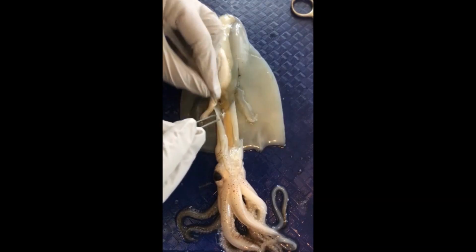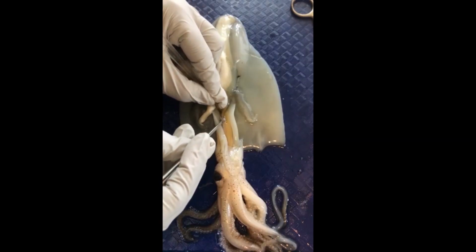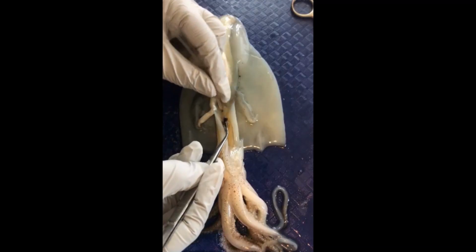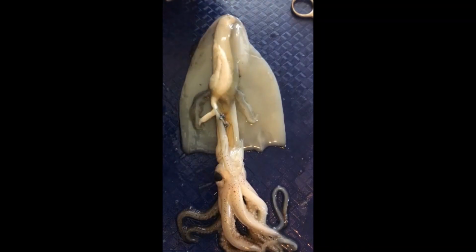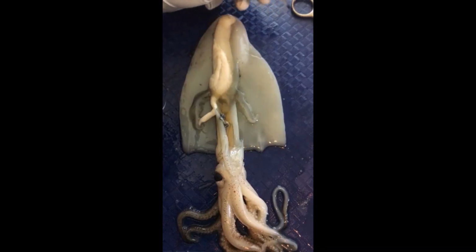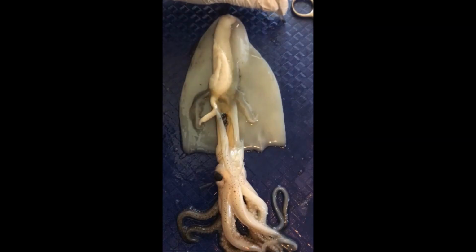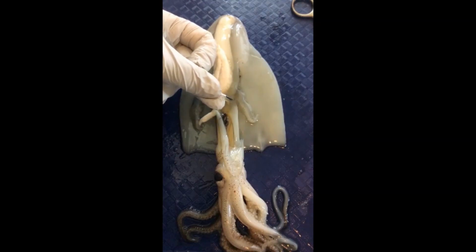And we'll see if we can write our name. There we go. So I opened up a little bit of it, just like that, so you can see the ink actually coming out. All right, and see, then I can write my name. It's a little bit harder to see on here, but look, I can put my name and you can scribble. So that can be a fun activity once you've looked over the anatomy, to see if you can use the pen and ink made from the squid.